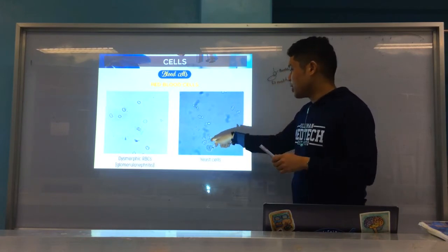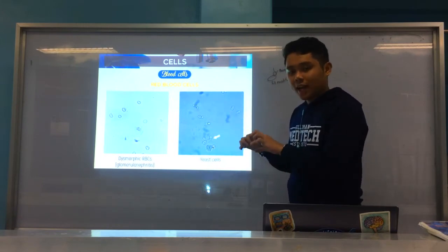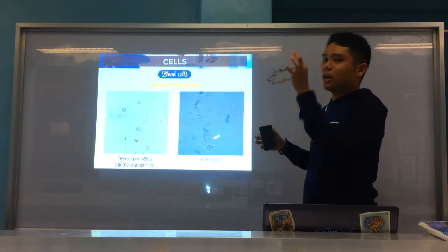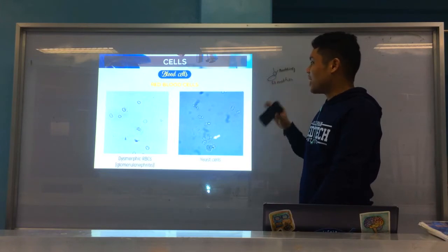So if you see cells connected to each other with small protrusions, that could be a yeast. They are connected because they are budding from the mother, and then they bud again, so there is something like a connected neck. That is in your mycology, okay?